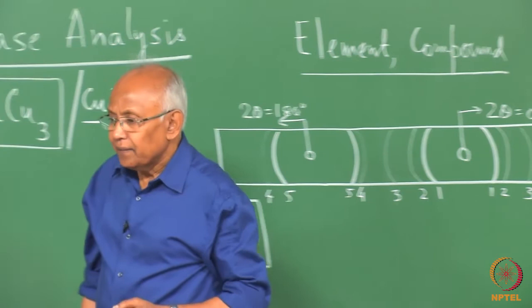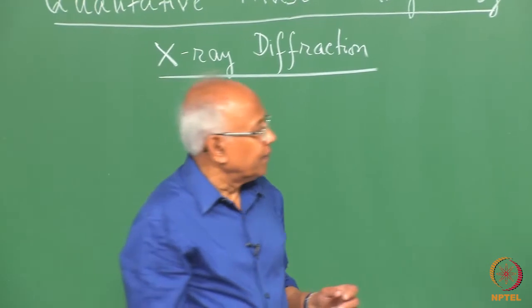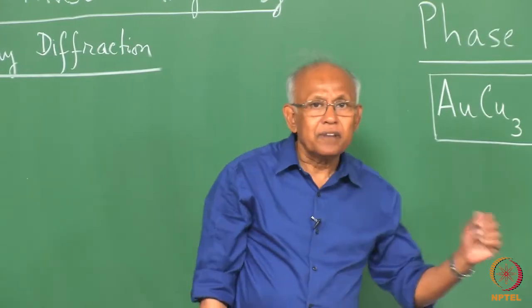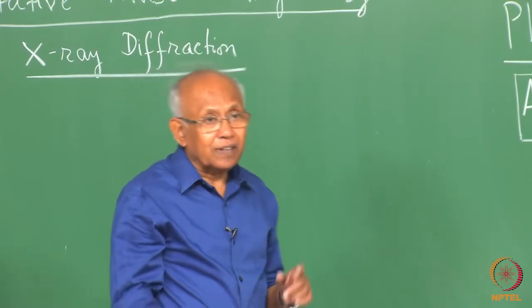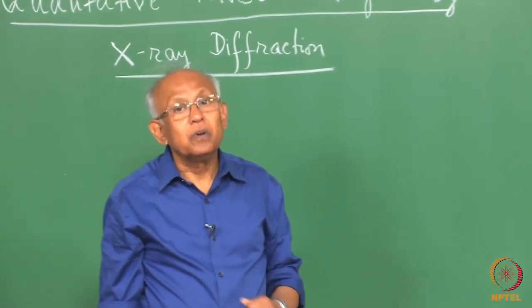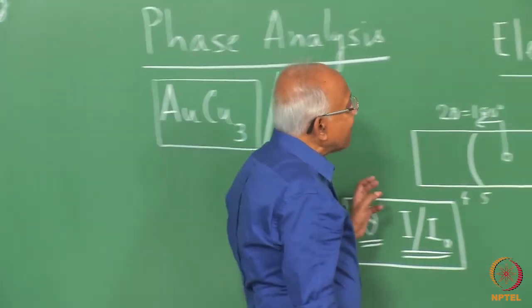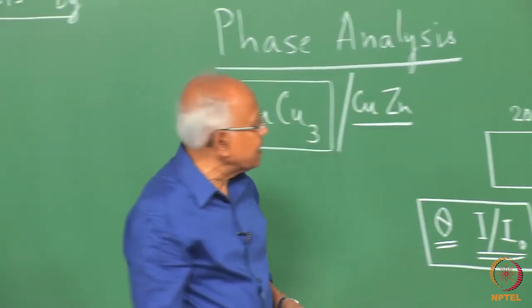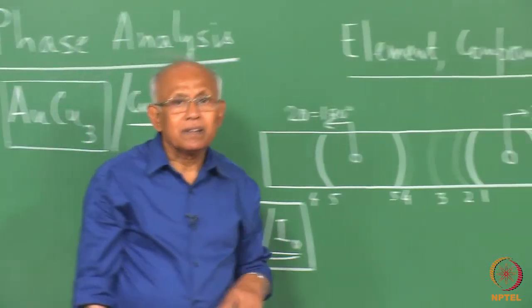different. In fact, just as by recording the fingerprint from two different persons, they can be distinguished because each person has a definite type of fingerprint which is unique to that person alone. Similarly, the diffraction patterns taken from two elements A and B or two phases A and B are also very unique to the corresponding materials.